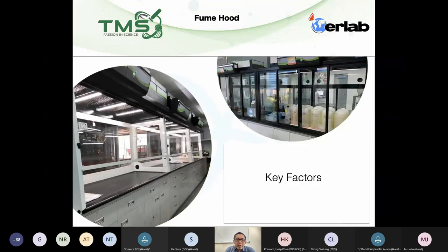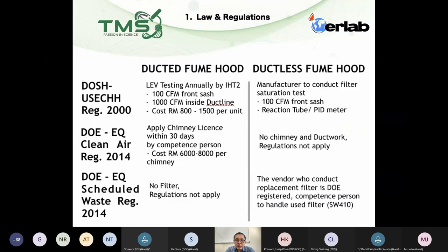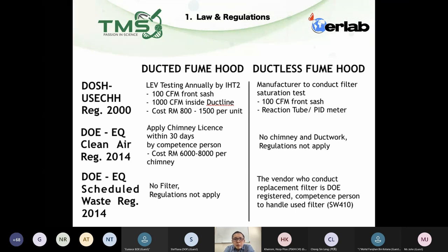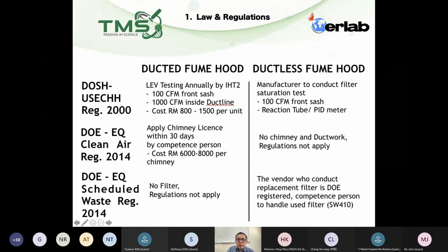Now let's look at key factors when considering a fume hood — ducted or ductless. This is a basic introduction; for more information you can talk to your CHRA and also your hygiene technician. I'll compare the ducted fume hood and the ductless fume hood so you have an objective understanding of what to consider.